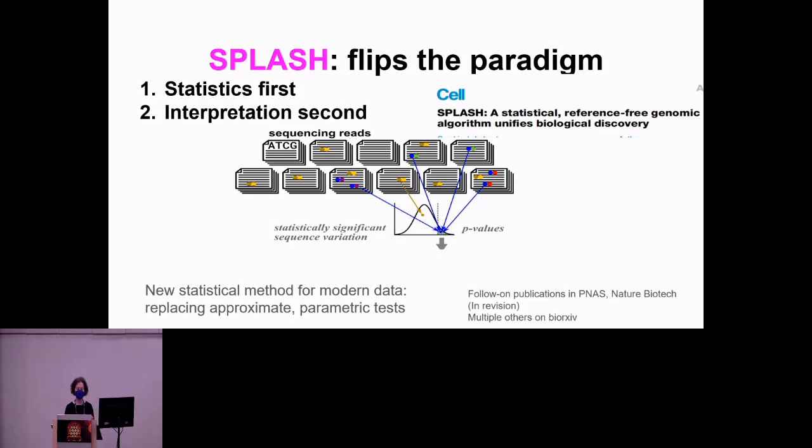So what do I mean by statistics first? You take any set of sequencing reads that you have. Each of them is depicted as one of these file stacks. What the algorithm does is it essentially searches through all of the k-mers in every file. And then it fixes a single k-mer. Let's just, for sake of discussion, pick a blue k-mer. Blue is some sequence like AT, GGG, etc., about 27 long. The algorithm will do this in parallel for every single 27-mer. But for the blue one, it looks for it in every file.